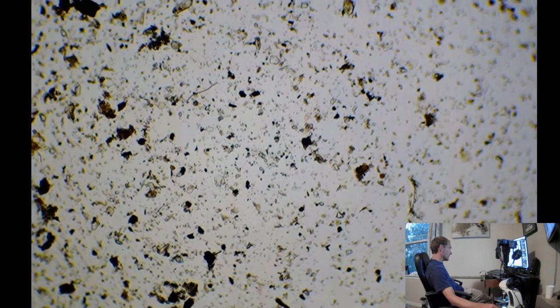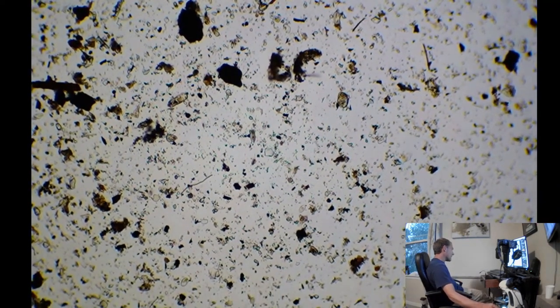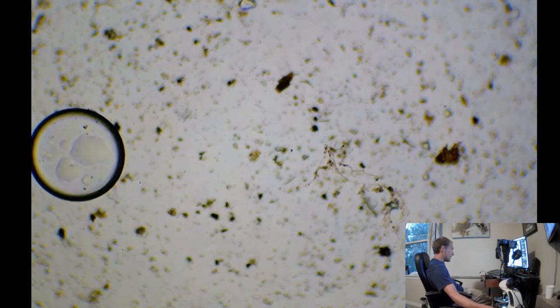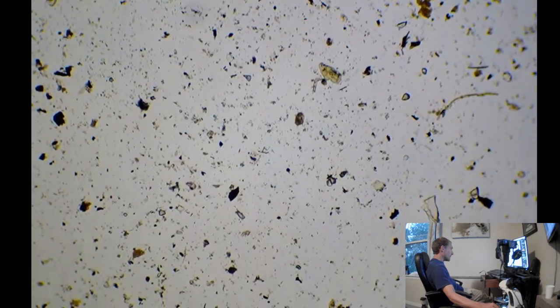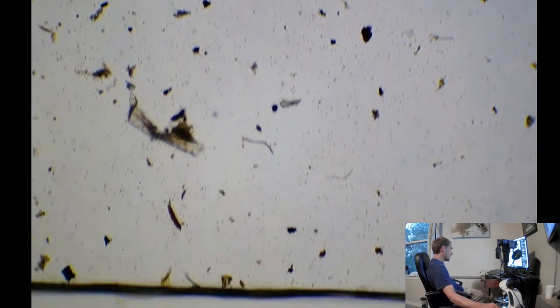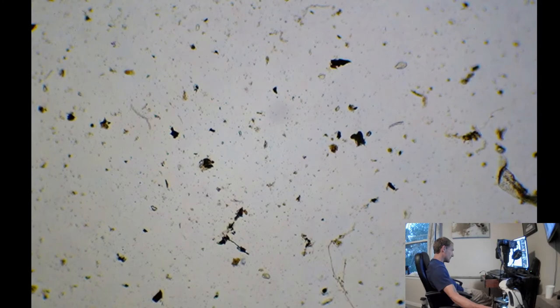Couple little fungi strands. Just an aggregate. One of those spidery clear strands. We'd be looking really good if we didn't see so many of those spidery clear strands. Could use more fungi though. Yeah, that one. I don't know. I'd like to see some more darker fungi strands.